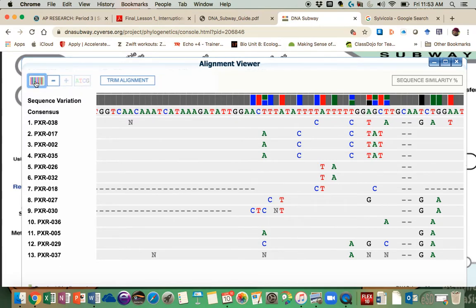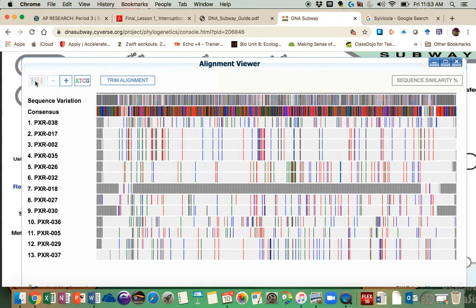So we can come back here, and if you've pulled up the sample papers that I've sent you, you'll see how they use the alignment viewer, right? That's here, to actually make a case for your findings and look at some of those differences, okay? And always keep in mind that when you look at your findings, you want to compare it back to your original hypothesis based on the locations of where you collected your samples from, okay?